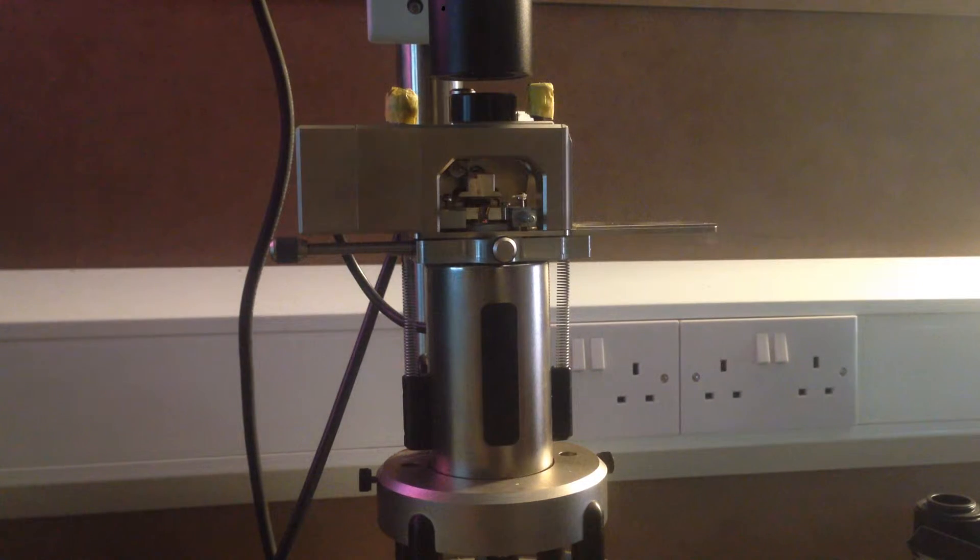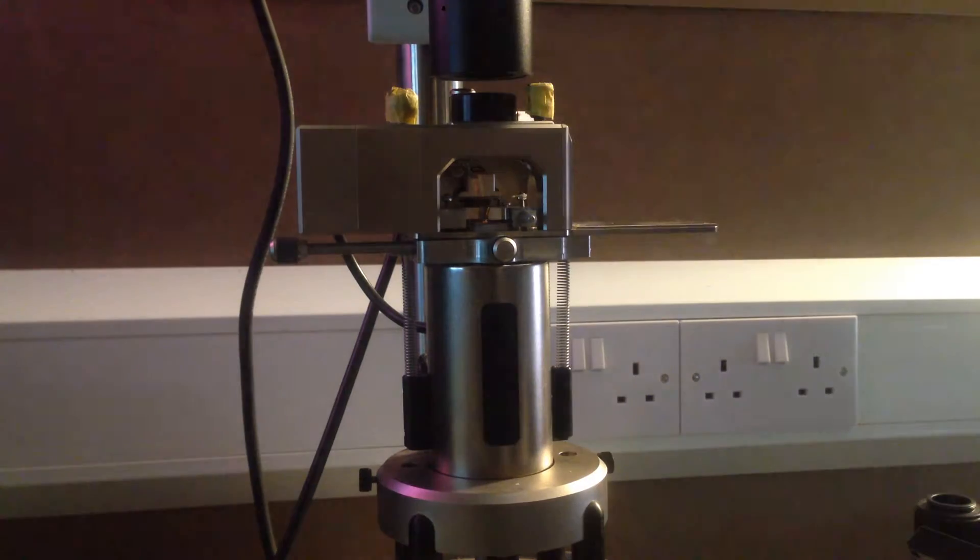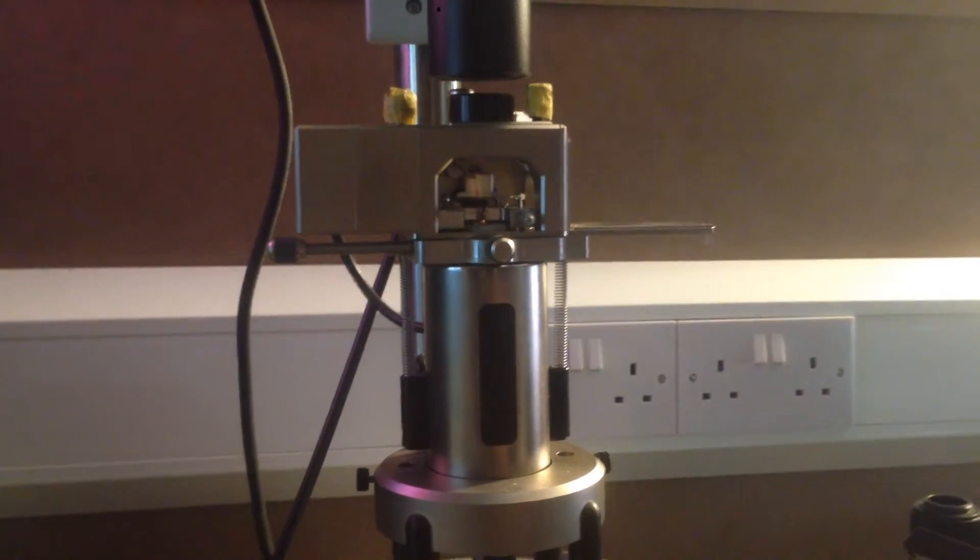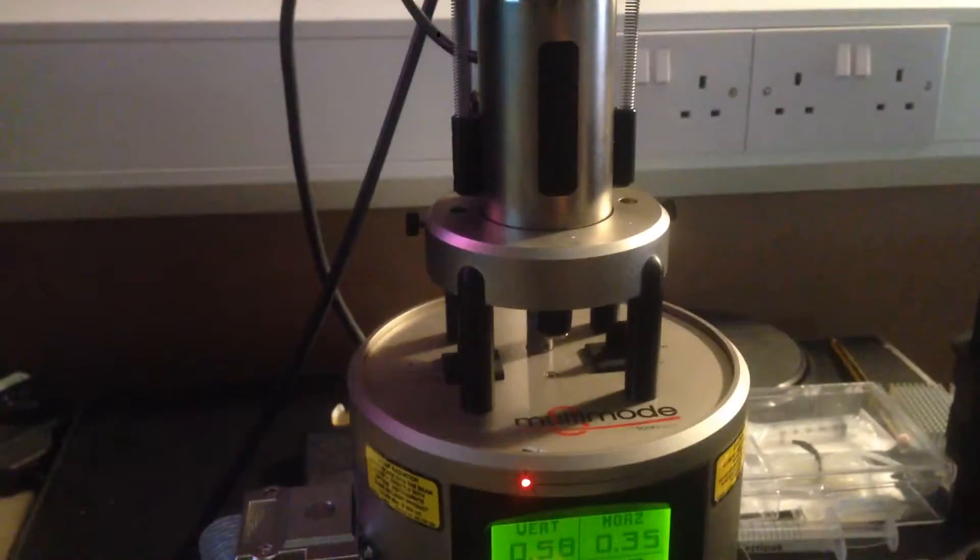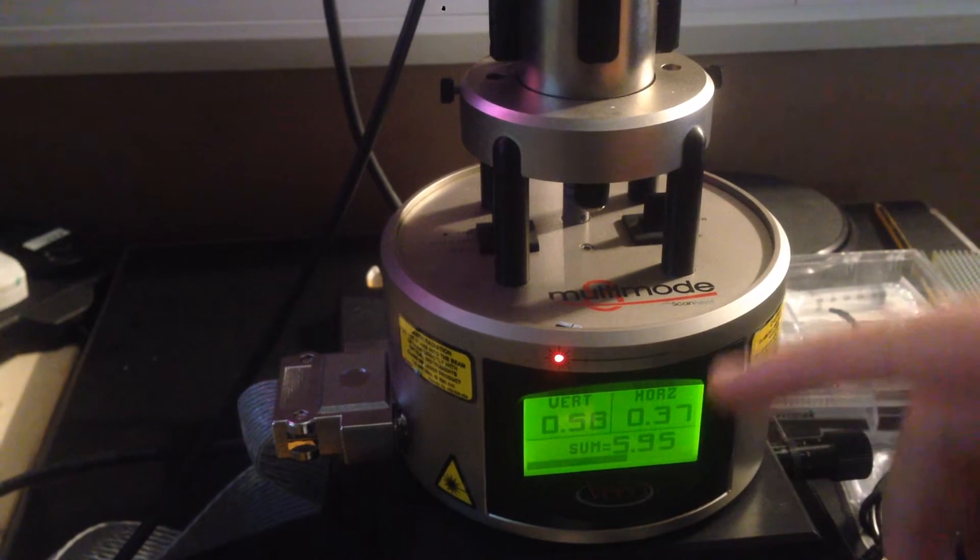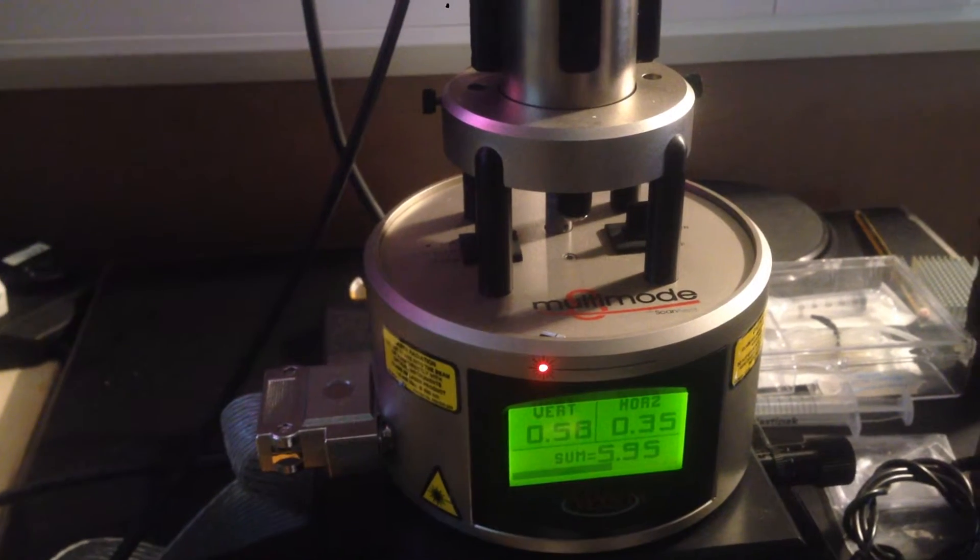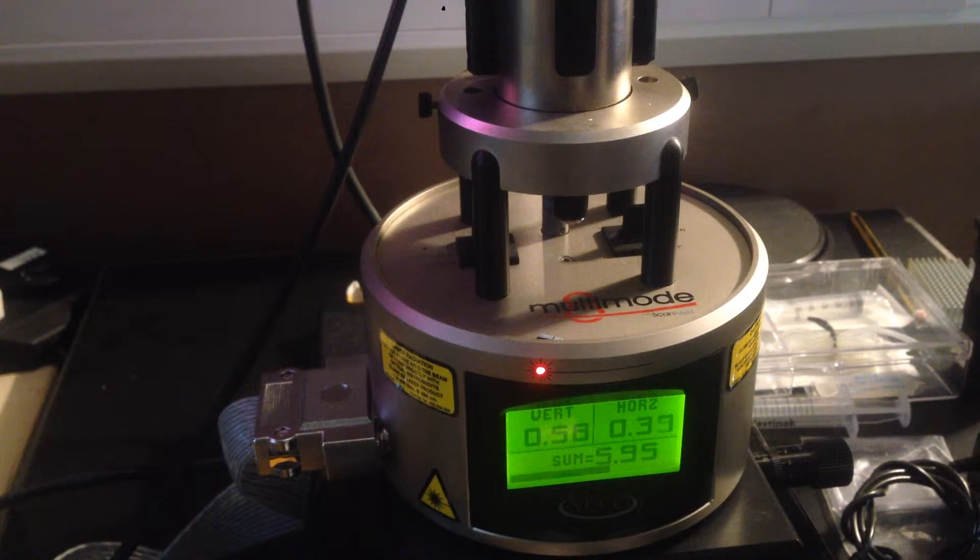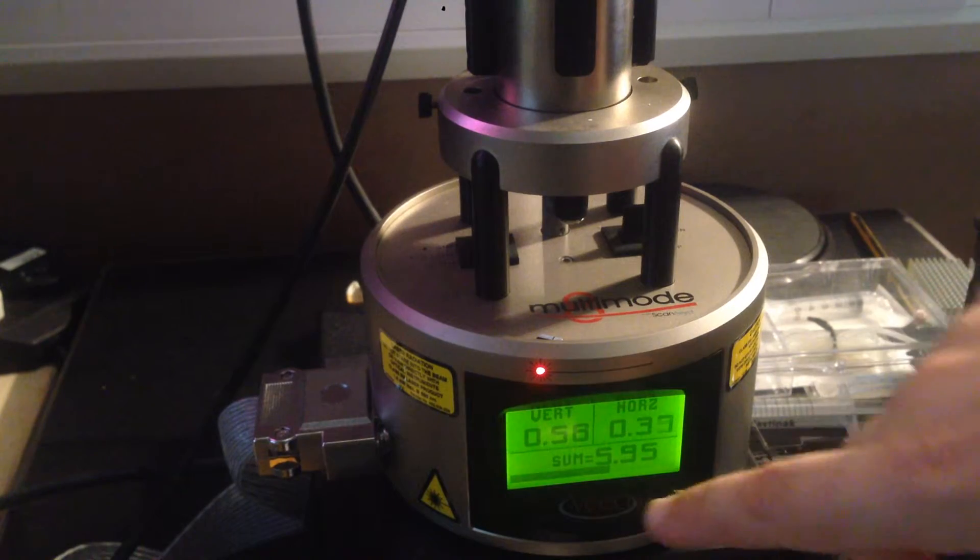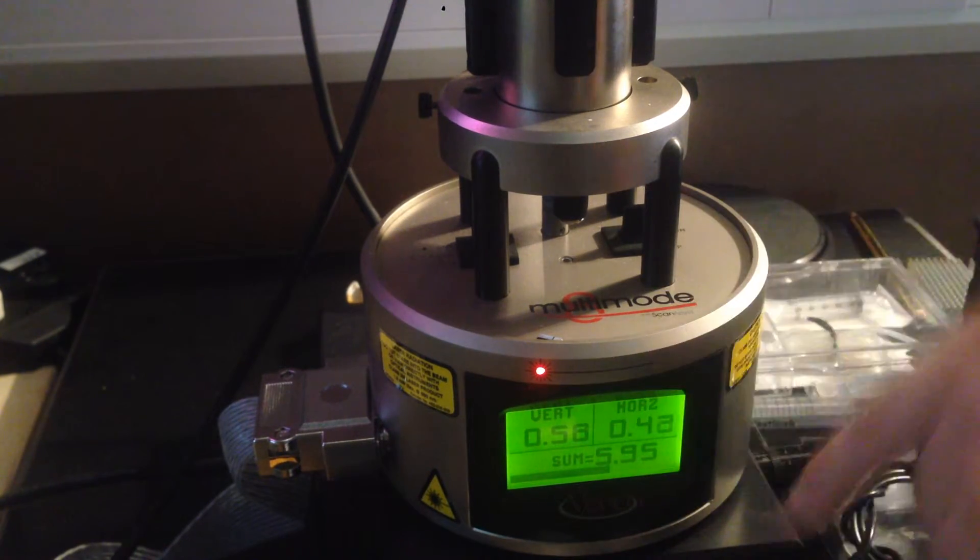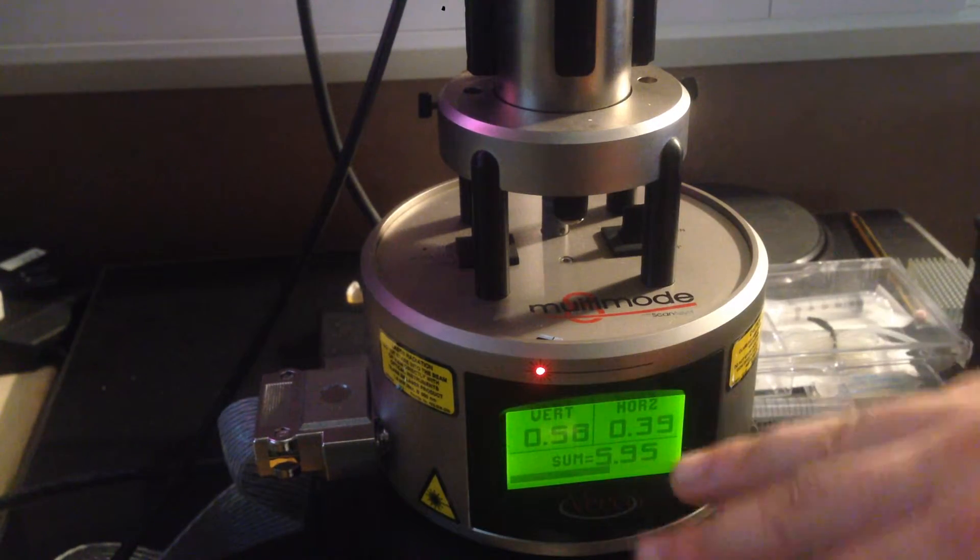The last video cut out before I could finish recording, but we got the laser tuned and moved the spot to the very top of the cantilever. We got this number to be, it should be a bit more than six really, but I think this is fine.